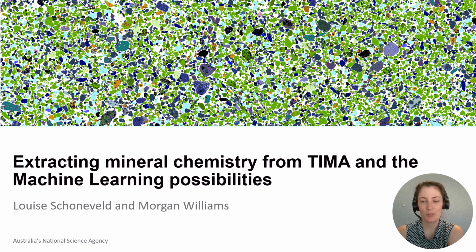Hello, this is a talk that I gave in October of 2024 to the Automated Mineralogy User Group meeting, and it covers extracting mineral chemistry from TIMA, which is an automated mineralogy technology based on SEMs, and how you can use it for machine learning applications.